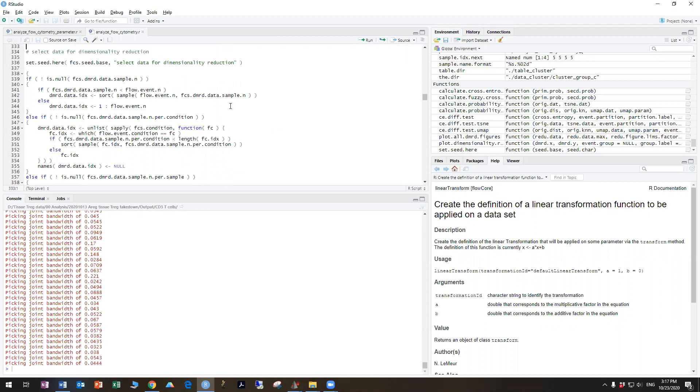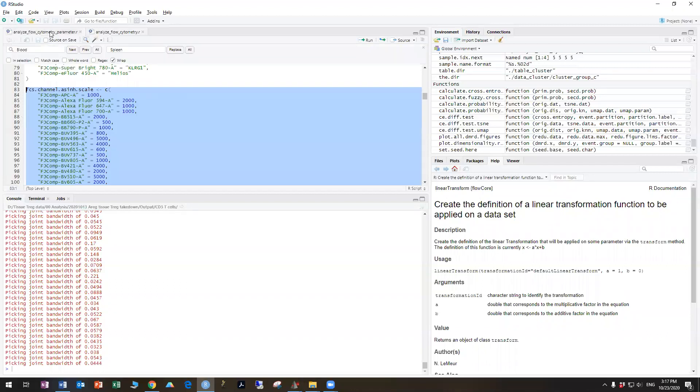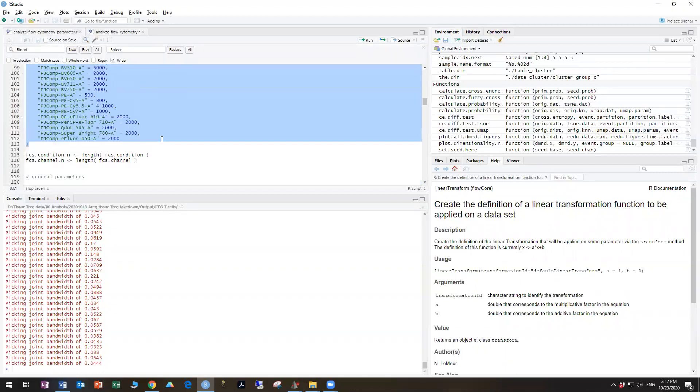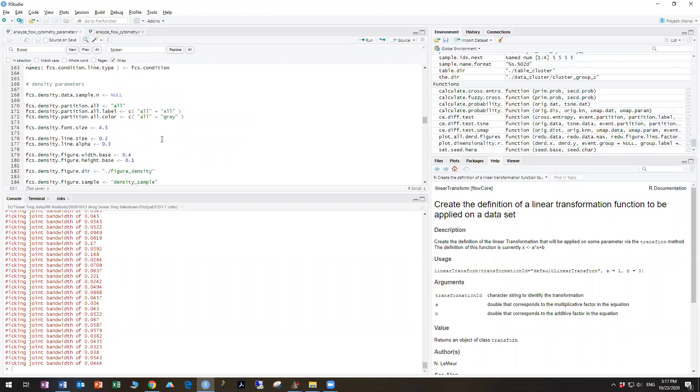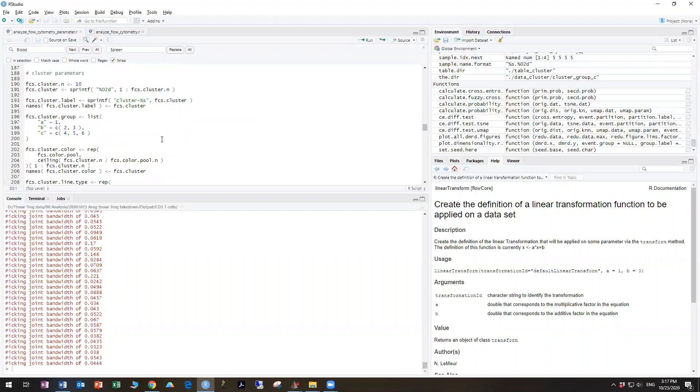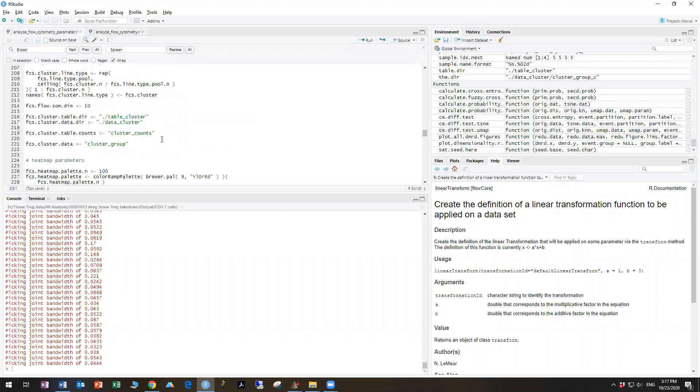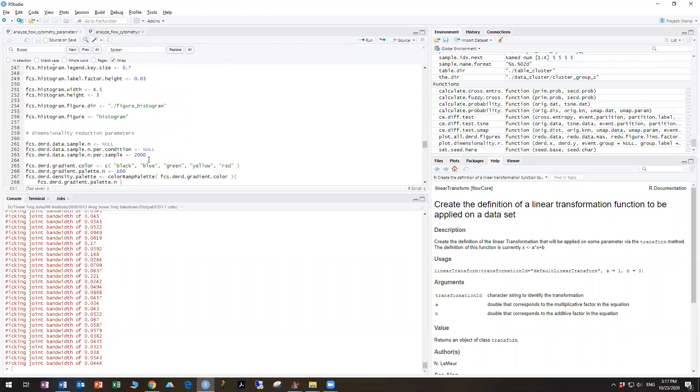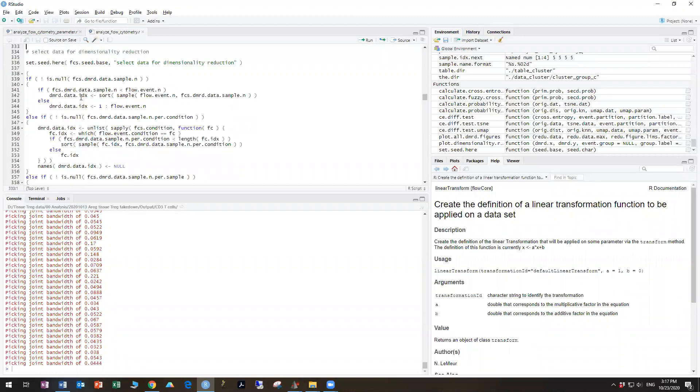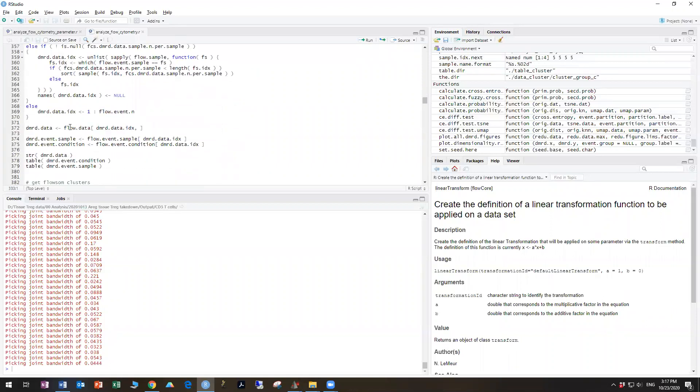which is to start the data into the actual high parameter analysis that we're interested in. So the first step is to select the data for dimensionality reduction. If previously in your parameter file you have set that only certain numbers of cells are going to proceed forward via the downsampling, as here I've set 2000 events per flow file, it's going to select that now in this next command.